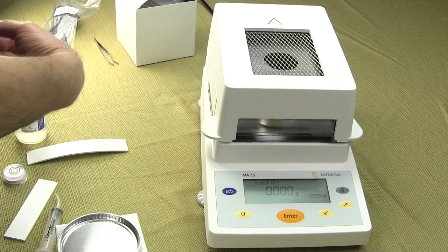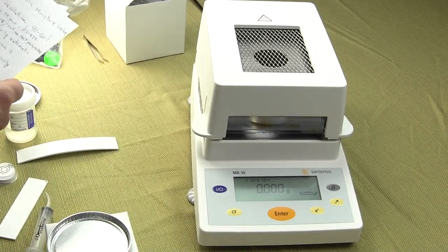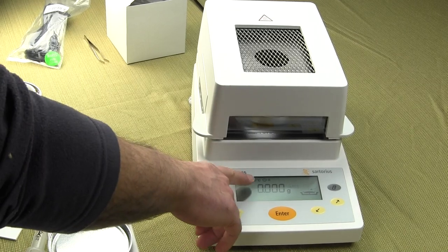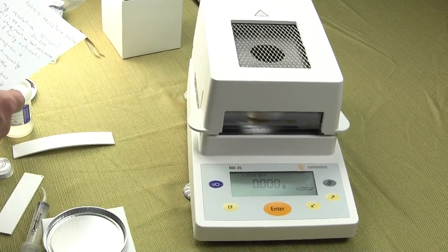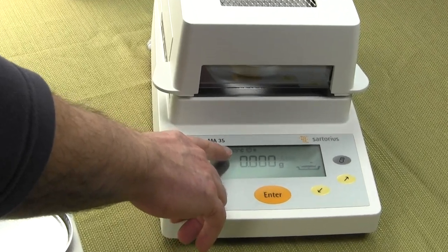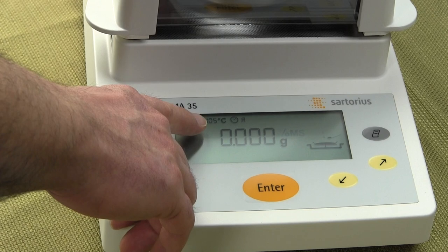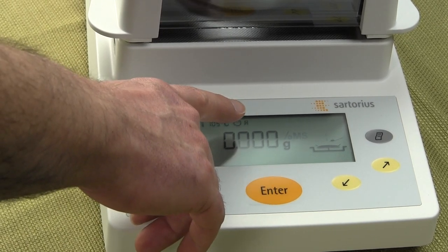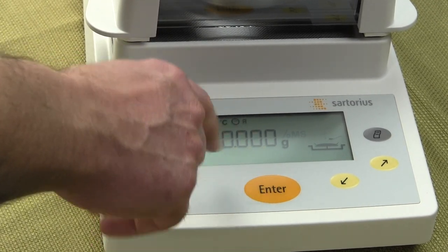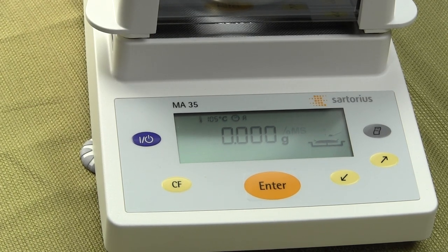On the LCD display at the top, you can adjust the temperature. On this moisture balance you can set the temperature anywhere from 40°C up to 160°C. The default out of the box is 105°C. You can put this in auto mode or manual mode — right now it's in auto mode and we'll do a demonstration showing how to use it.